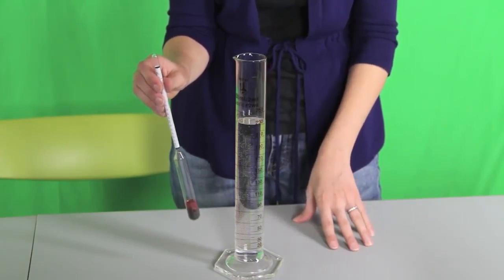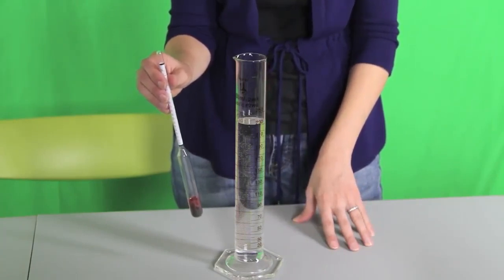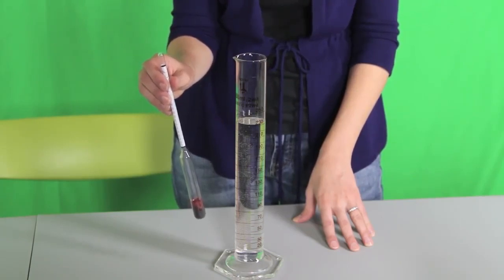Bring the sample liquid to the temperature marked on the hydrometer. This is 68 degrees Fahrenheit for specific gravity. The reading will be inaccurate if the test sample is not at this temperature.